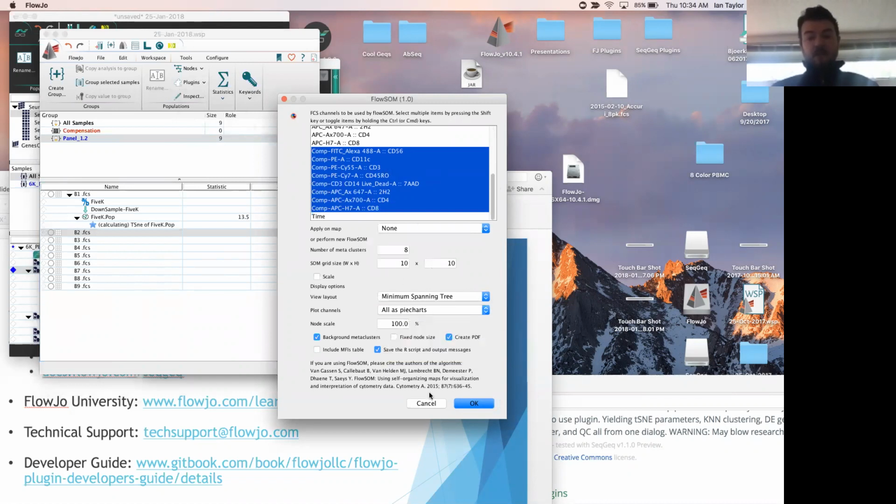And I think I'll just go with the defaults as far as settings. If you ever have questions about what these different settings do, oftentimes we'd recommend just mouse over the setting and you'll get a little tooltip that'll describe what any of these fields is going to do when you make adjustments there.